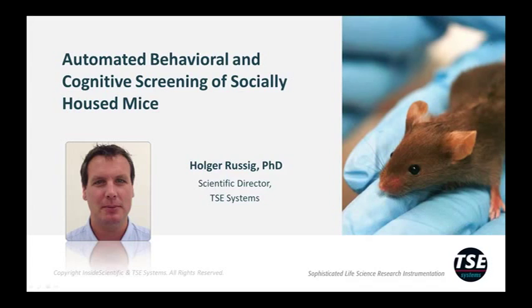A problem in classical behavioral phenotyping is also the inconsistency of genetic differences between labs. This is due to different experimenters, experimental setups, environments, and other factors. Therefore, a reduced stress induced by handling and a standardized equipment should lead to enhanced data quality.